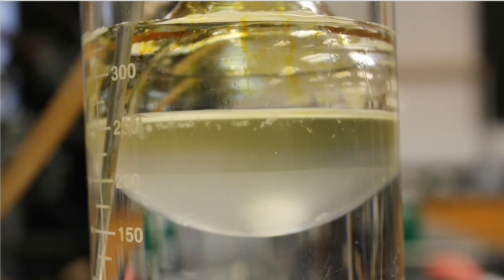Guys, what you see in the picture right now is the addition of the sodium hydroxide, just the still image of it. Once more, as I said in the video, write down your observations, write down what you see, because those are important things that need to be included in a proper laboratory notebook, whether you're in academia or whether you are working for a company that's going to require one.